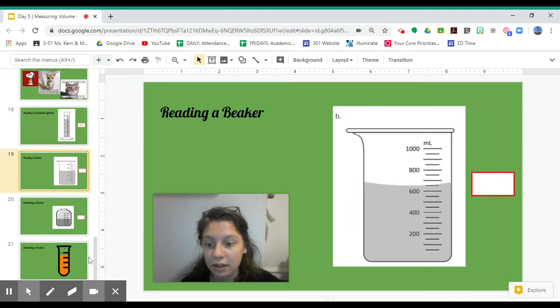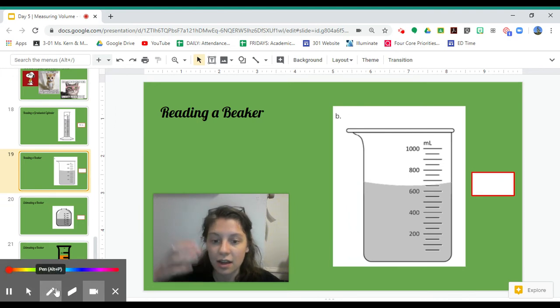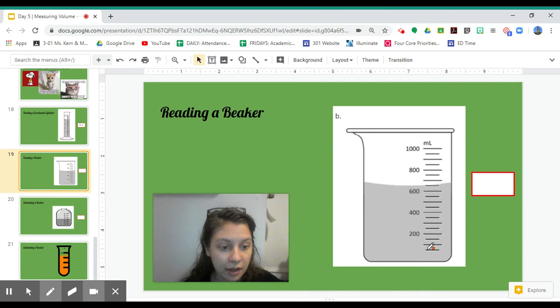Now we're going to look at a beaker. I know this is a beaker because it's larger, wider than a graduated cylinder, and it's usually used for larger volumes of liquid. If I put my 0 down here—because we start at 0 if there's no liquid—0 to 200. Oh, I forgot to find my meniscus. My meniscus is right here, the bottom of the curve. So this line right here is what I'm going to be measuring to. Now I need to figure out what that line is.